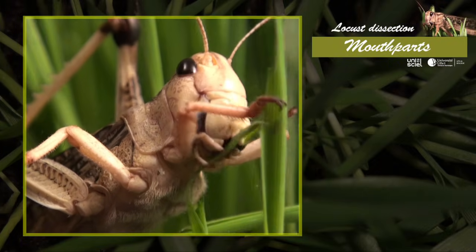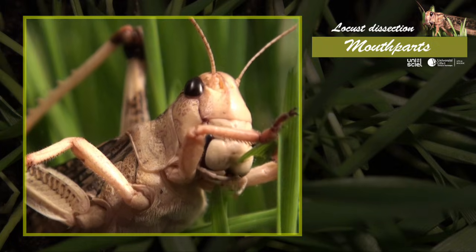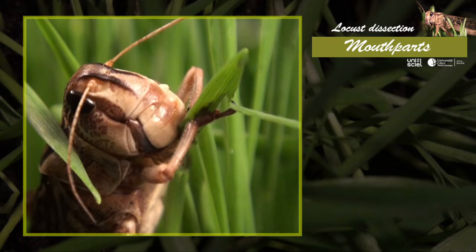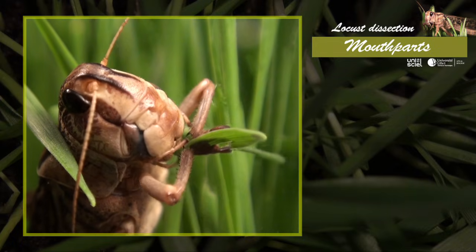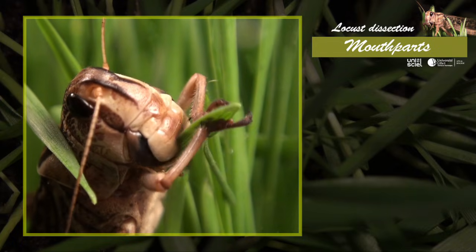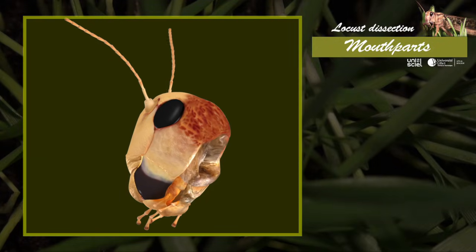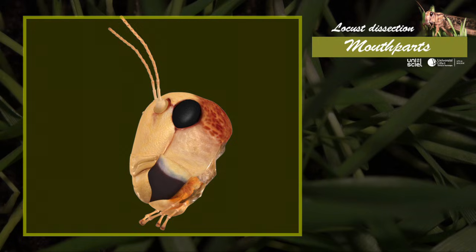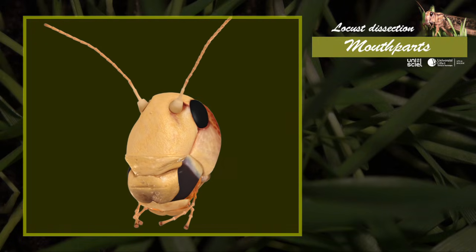The locust has a herbivore diet. The grinder mouthparts are pointed downward in a hypognathous disposition. This head region is comprised of several articulated pieces adapted for biting and chewing plants.